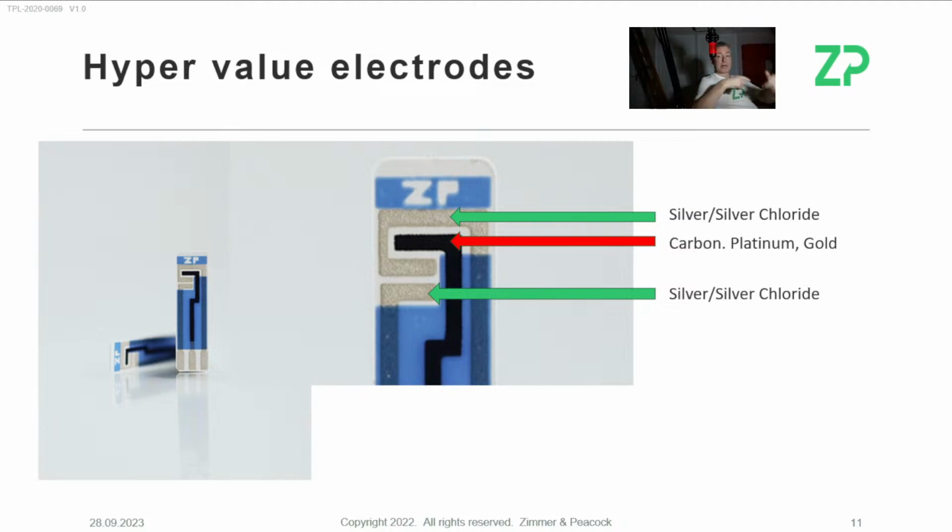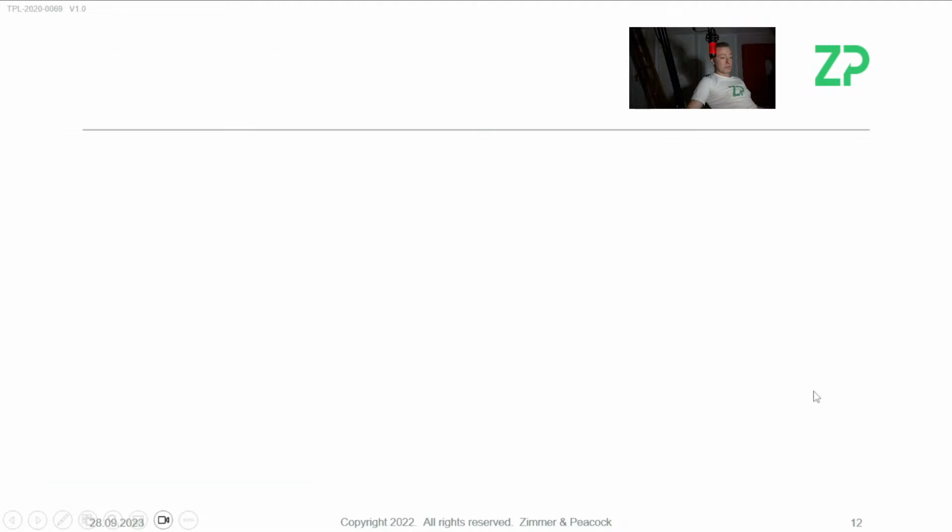And so I've seen this kind of chemical closed loop where materials on the counter electrodes, which are generated during the experiment or the analysis, end up diffusing to the working electrode and causing a closed feedback loop, which then generates more reaction, let's say, on the working electrode, that generates a counter electrode. And that's what I mean by a feedback loop. These materials are chosen because of their inertness and also their insolubility. So it's not by randomness or accident that those materials are chosen.